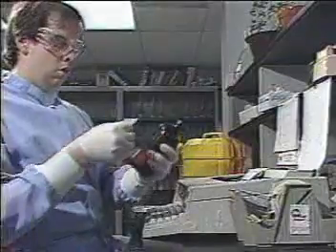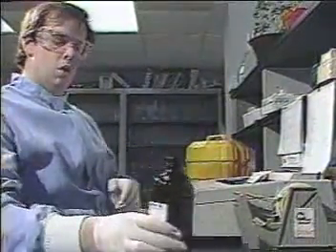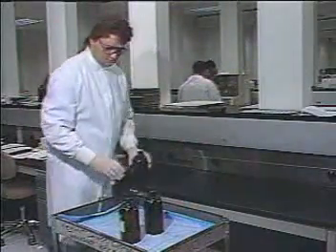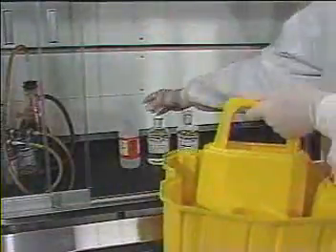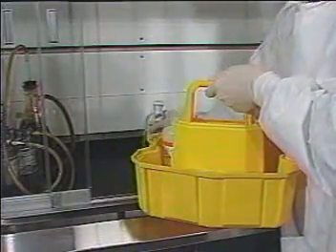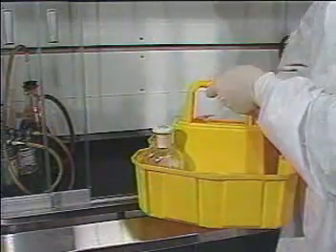Remember proper container labeling. You don't want any confusion where flammables are concerned. Benchtop storage is undesirable. Containers are easy to knock over and unprotected from fire. In-hood storage is also unadvisable. Containers interfere with the airflow design and increase the number of chemicals that could be involved in a hood fire.